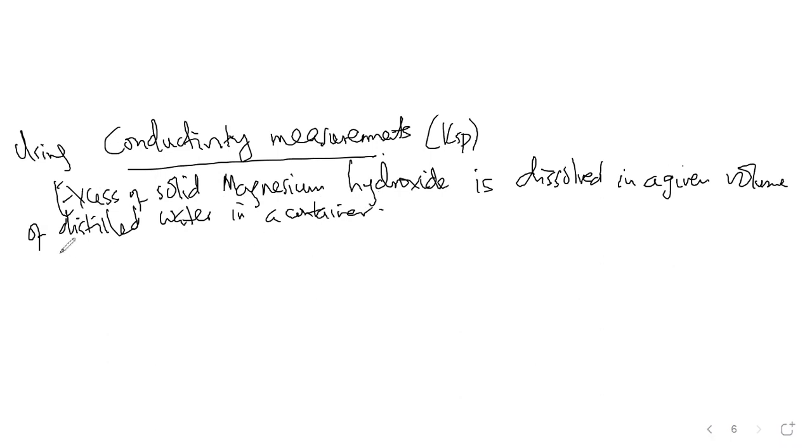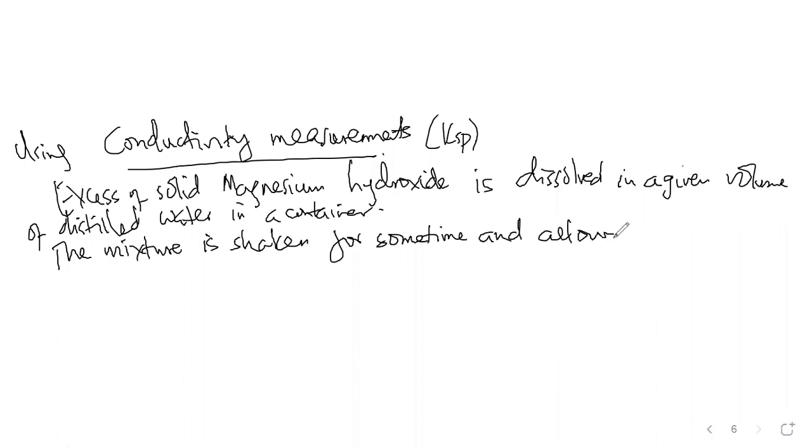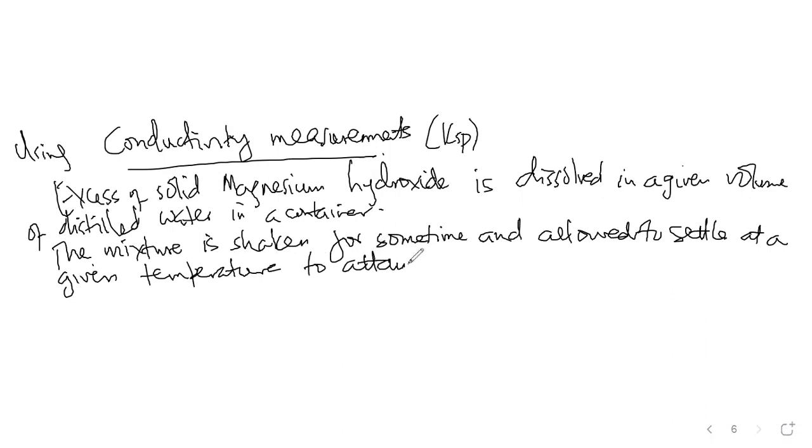The mixture is shaken for some time, as we have already seen, and allowed to settle at a given temperature to attain equilibrium.